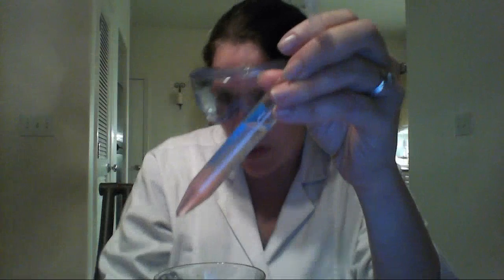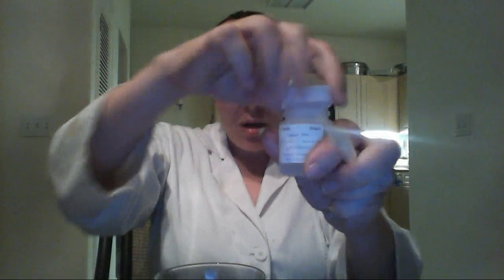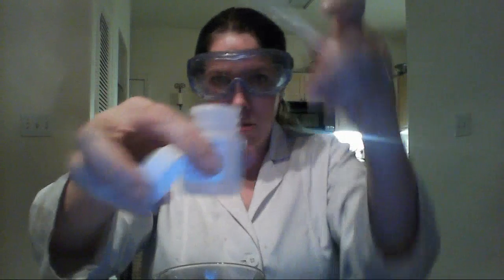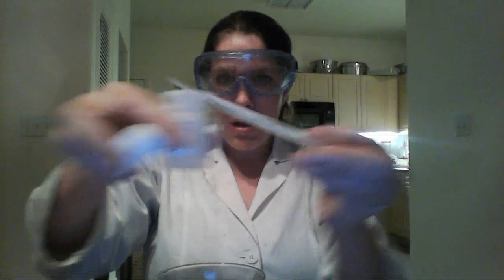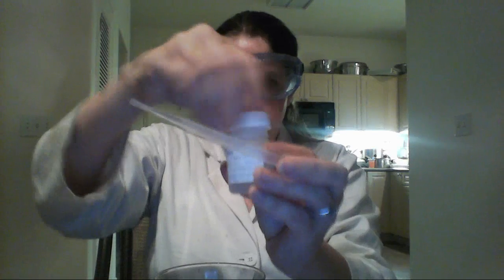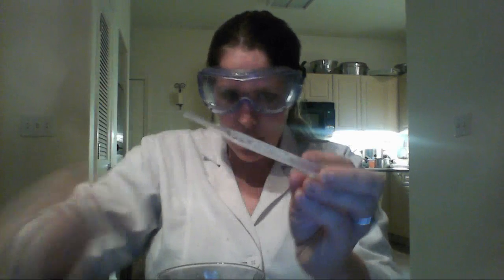I'm going to actually keep doing this till I get pretty much up to the top right here. So if you want to put this down, you can. Just be very gentle. You don't want to mix this stuff too much. So I'm going to very gently set mine down while I get another pipette full of ethanol. Okay. Yeah, and again, it'll probably take you about 4 pipettefuls to get enough of this done.